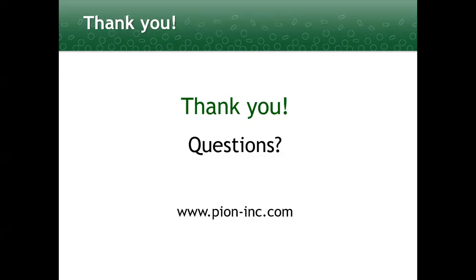Thank you. Next question is, when would you recommend the use of the immersion heater versus the external heater? I kind of like the immersion heater. Again, the only technical difference in terms of operating environment would be there's a limit of 10,000 hours, which is a really long time. It's a little bit over a year, right? But you can only operate the immersion heater for 10,000 hours.